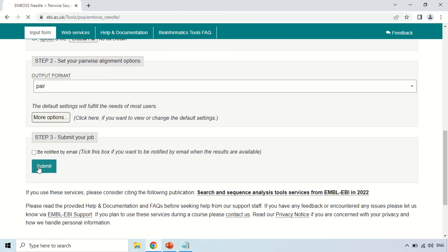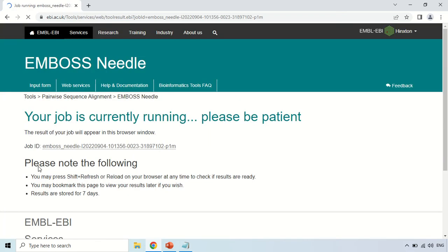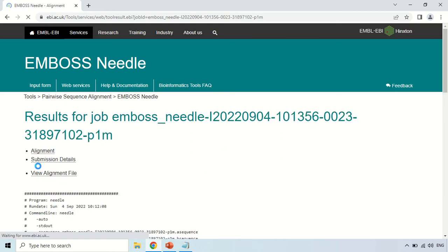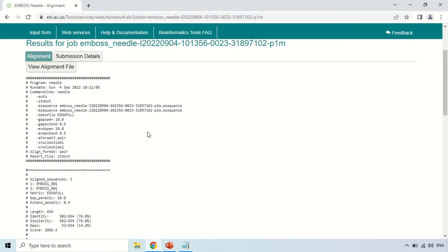After pasting both sequences, just click the Submit button. It will take a few seconds to give you the result, and a job ID will be generated. Now these are the results.